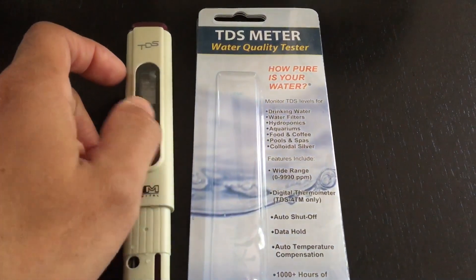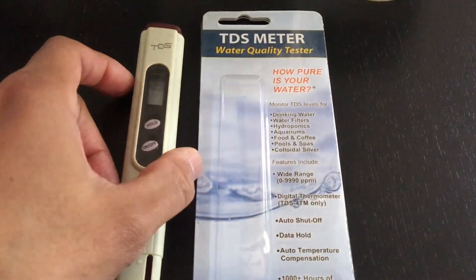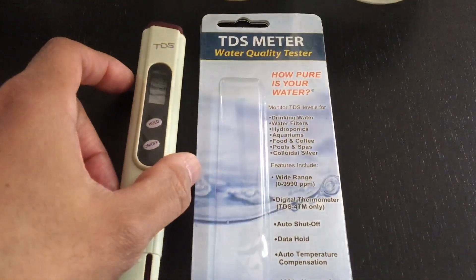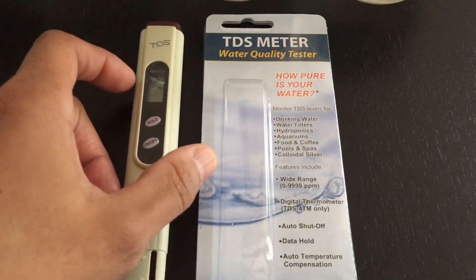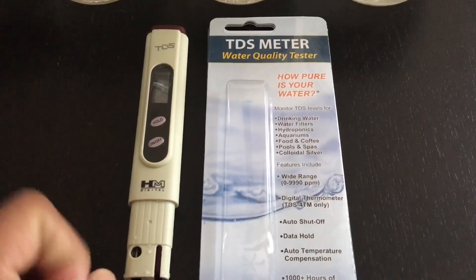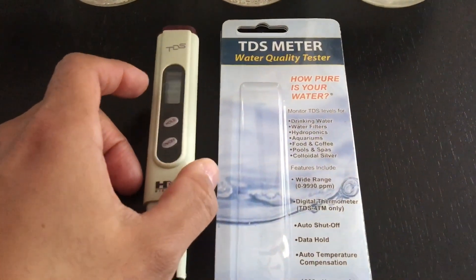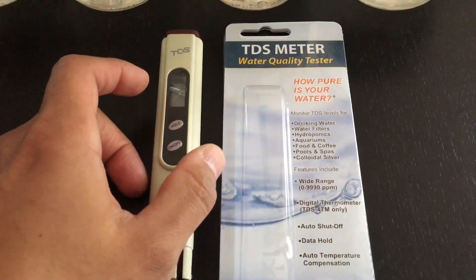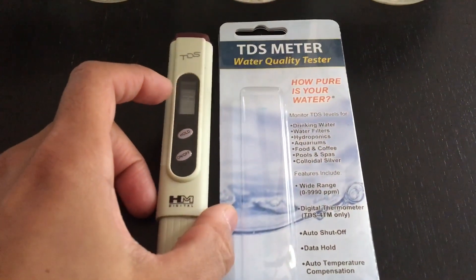I'm getting ready with this TDS meter to start testing water chemistry specifically for a reef tank. I will be starting a nano project. I used to have a reef tank about a decade ago and I think now, with all the advances in technology, it's time to start one up again. So in order to prepare myself correctly, I'm making sure to ensure good water chemistry, especially as it's essential in any type of low volume of water.